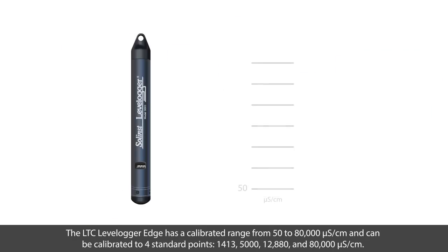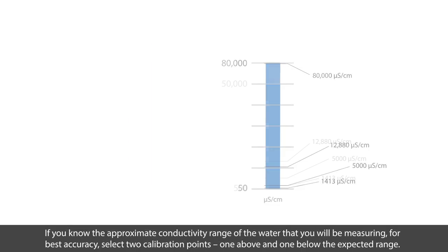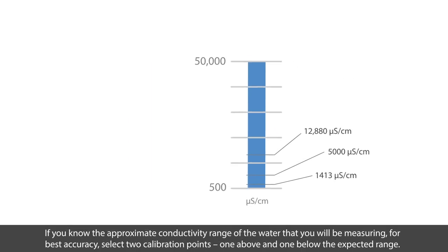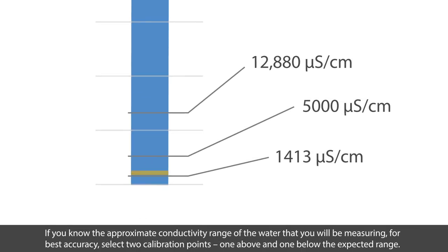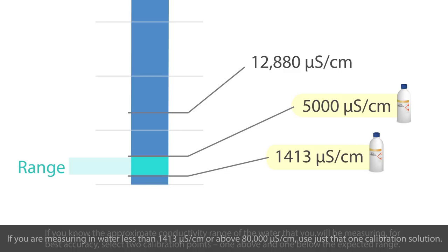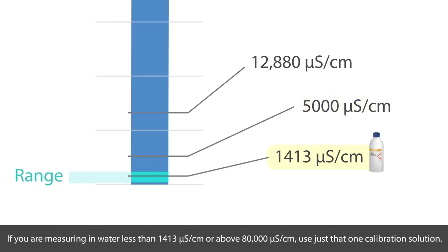The LTC Levellogger Edge has a calibration range from 50 to 80,000 microsiemens per centimeter and can be calibrated to four standard points. For best accuracy, select two calibration points, one above and one below the expected conductivity range for the water that you will be measuring. If you are measuring in water less than 1413 microsiemens per centimeter, or above 80,000 microsiemens per centimeter, use just that one calibration solution.